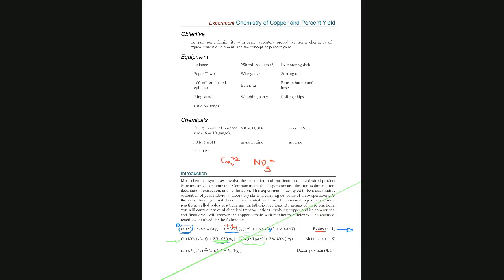And then this is a solution. So what we are doing is forming, from a solution, when we add the base, a solid of copper hydroxide.